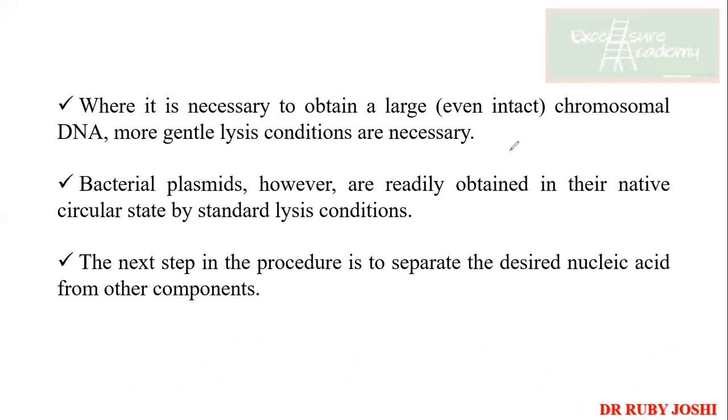When we start doing the DNA purification, I don't want carbohydrates. I don't want proteins. So at that time I need to throw them out. To throw them out, they should be present in the pellet. So it depends on what chemical I have added so that the protein gets precipitated out and DNA remains in the supernatant.